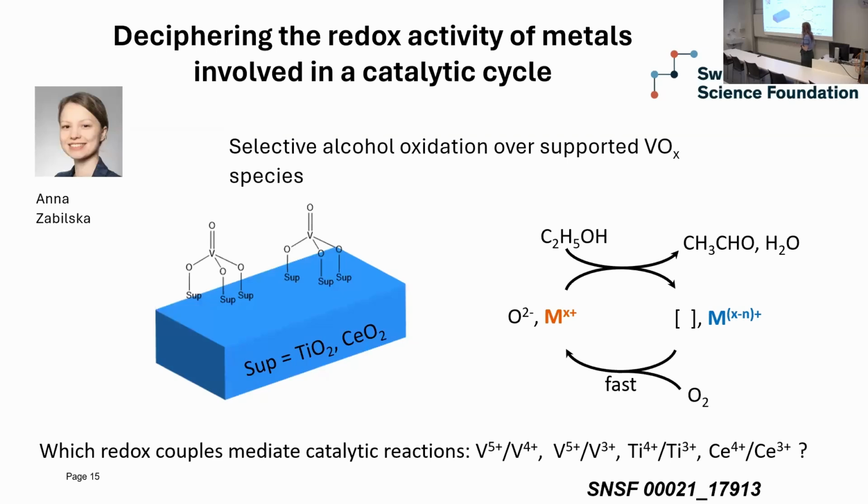What is peculiar about this catalyst is that vanadium with submonolayer loading can be greatly promoted by ceria and titania. It is also known that the oxygen which participates in the reaction is actually not oxygen from the gas phase.